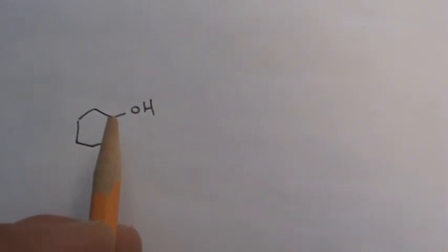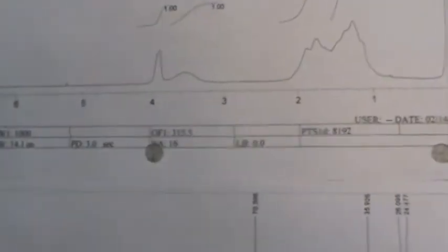However, the hydrogen on the carbon directly attached to the oxygen is going to be the signal arguably furthest that way. And that one will be talking to multiple next door neighbors above and below the ring, whereas the hydrogen on the oxygen should be sort of a single broad kind of thing.